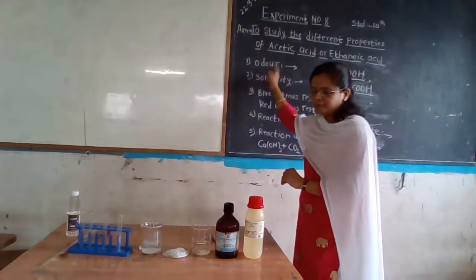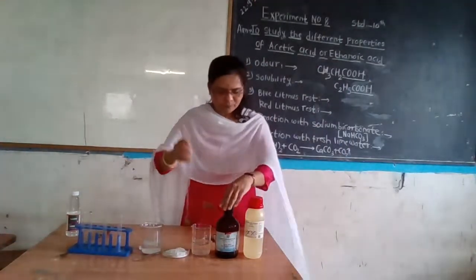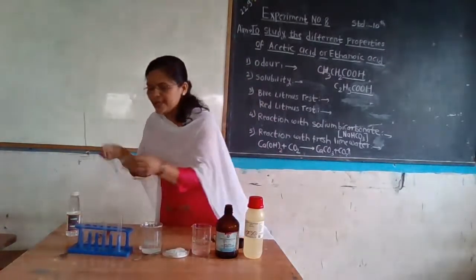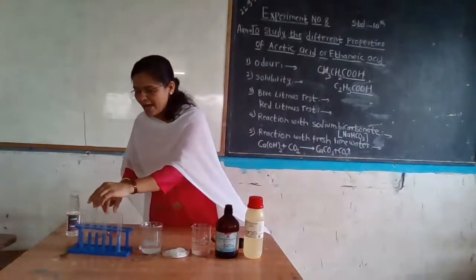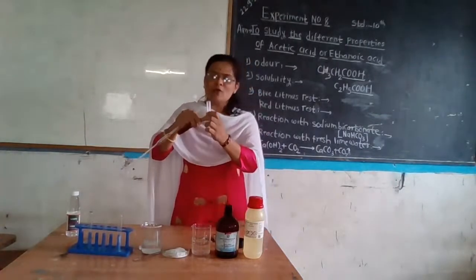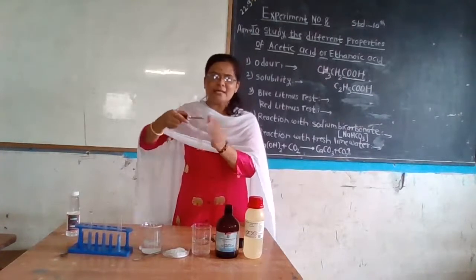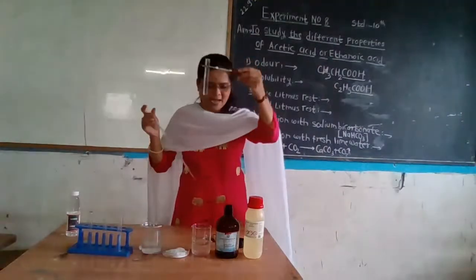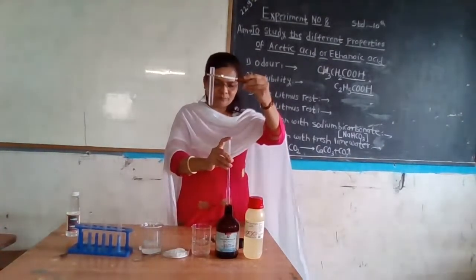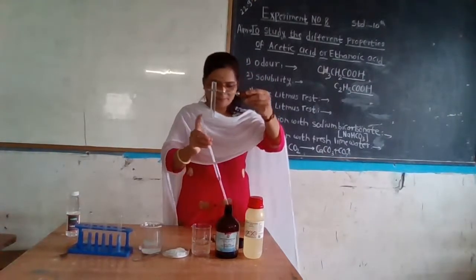How is the odor? I am taking a few drops of acetic acid in a very dry test tube. The test tube should be dry to avoid any contamination and to get proper results.